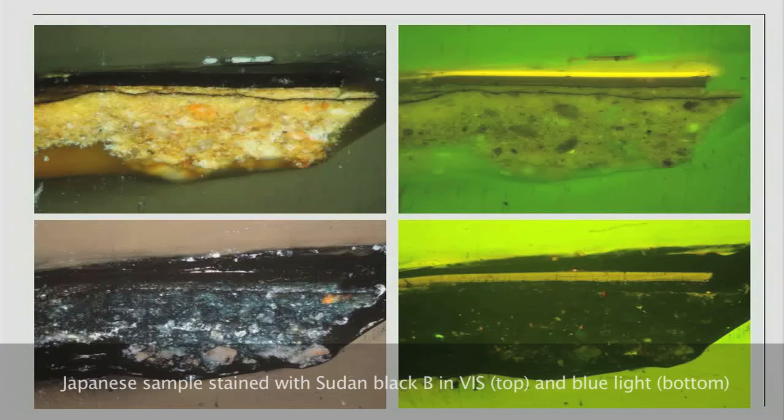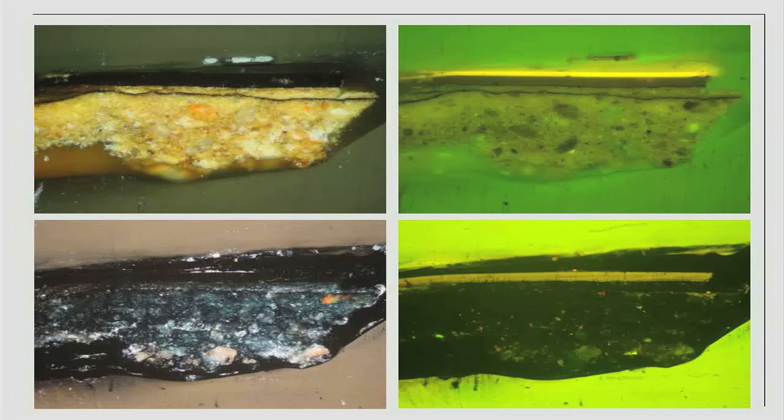Viewing all four images from before and after staining next to each other, clearly reveals the differences that are made visible by the staining process. Please note that the black staining seen around the entire sample is an interference of the Sudan black with a coating agent that was applied on the lacquer sample surface to protect it against resin infiltration prior to embedding. This coating is not part of the sample and should therefore be ignored during interpretation of the staining results.